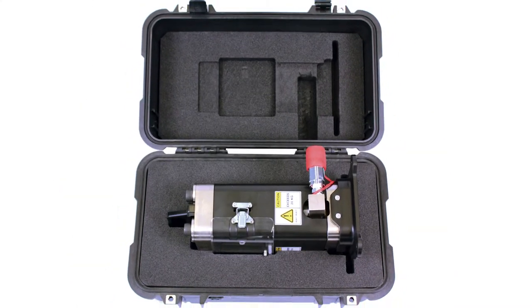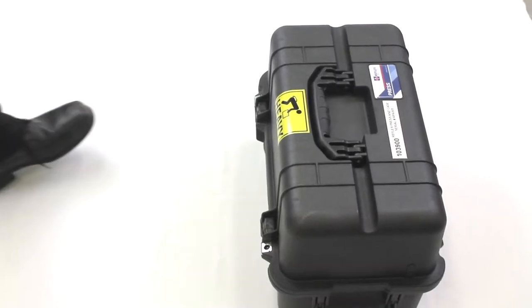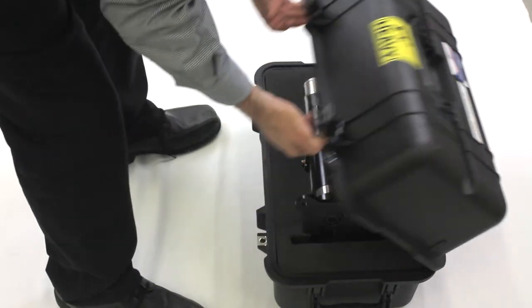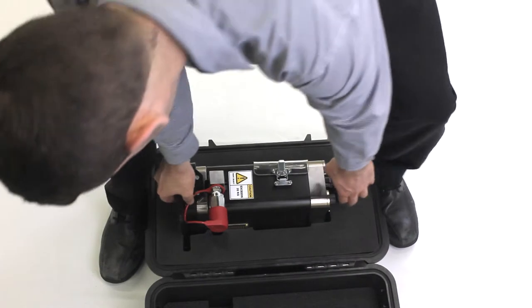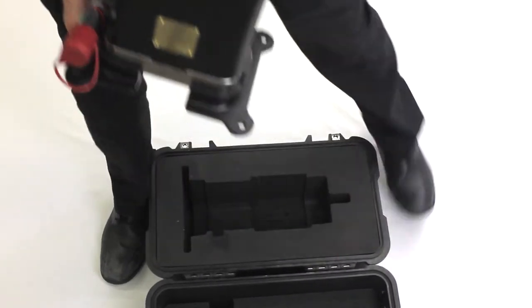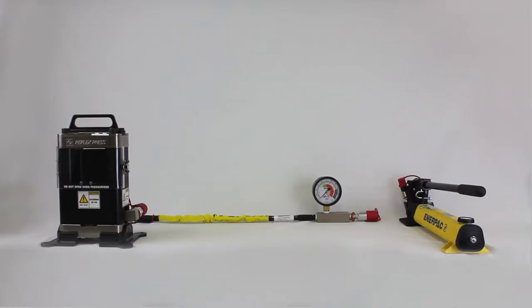The second case contains the Reflex Press. To remove the press from the case, the case can either be placed on the table or on the floor. Use care when lifting the unit from the case as the press unit weighs approximately 25 kilograms. When removing the press from the case, lift the unit from the handle and the base. Do not lift the unit using the hydraulic fittings as damage could occur.